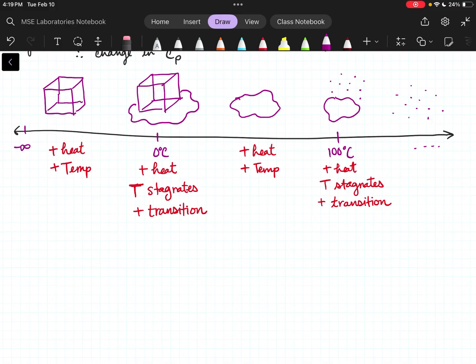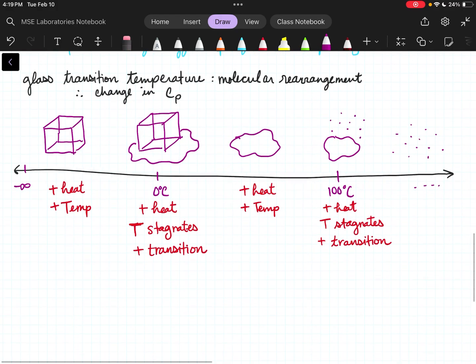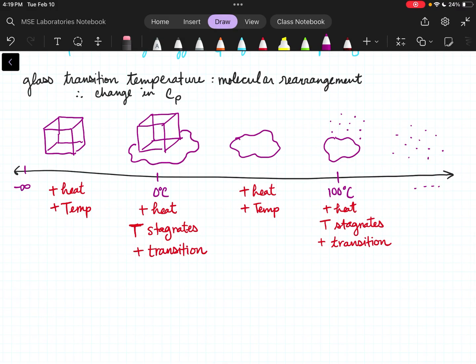That is the danger. Oh, I meant to say this earlier, speaking of cheese. Glass transition temperature is when something goes from hard to soft, and everything is always solid. There's still solid particulates. It's not melting. Cheese doesn't melt. Cheese goes through a transition temperature rather than a true melt, because the solid particles are still intact.